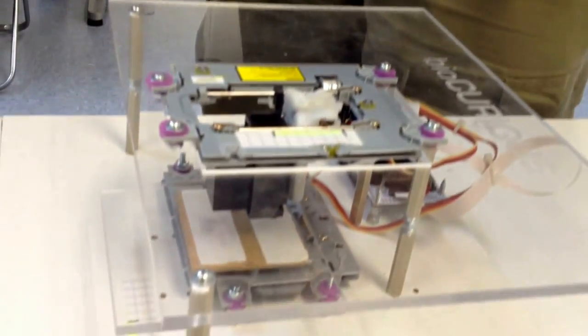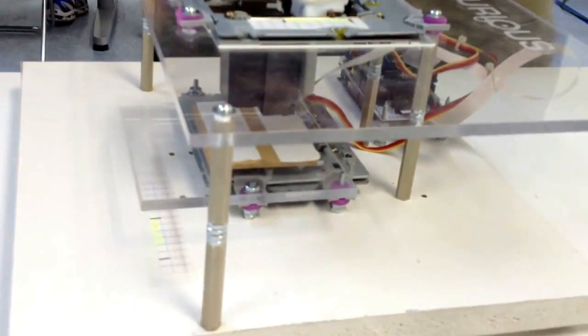And this is just an inkjet cartridge essentially. So we can actually print live cells using this. We open up the inkjet cartridge, put say an E. coli liquid culture in there, and put a petri dish here on the bottom. And we can print those cells onto that petri dish.